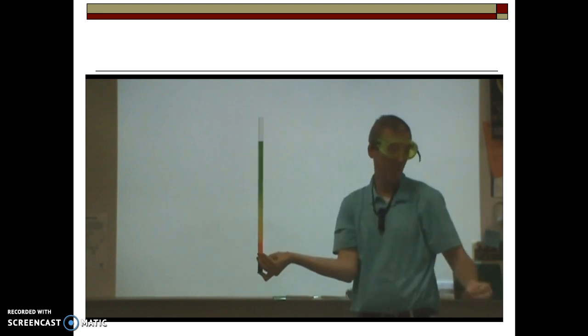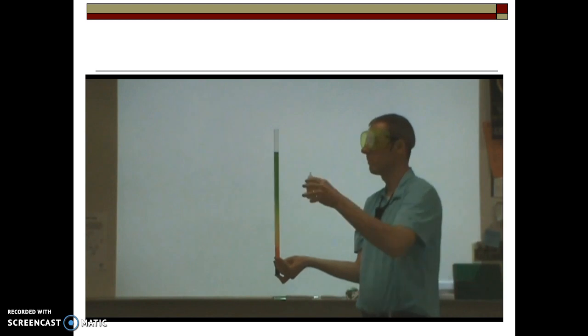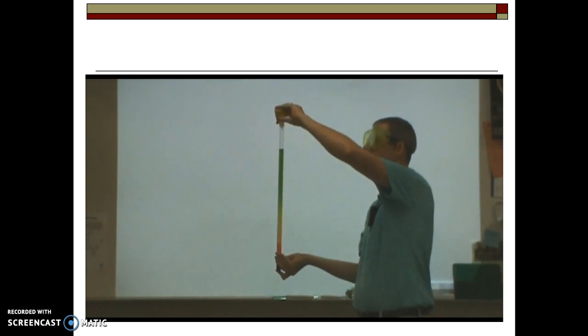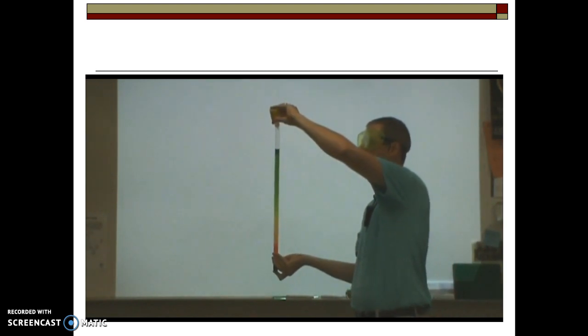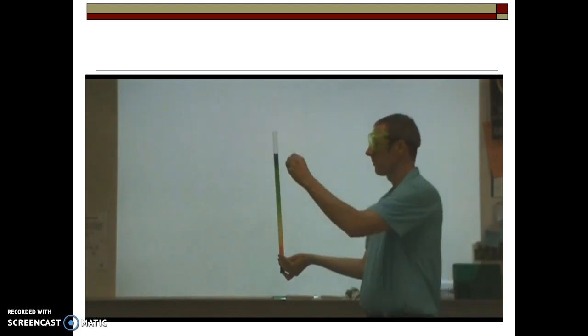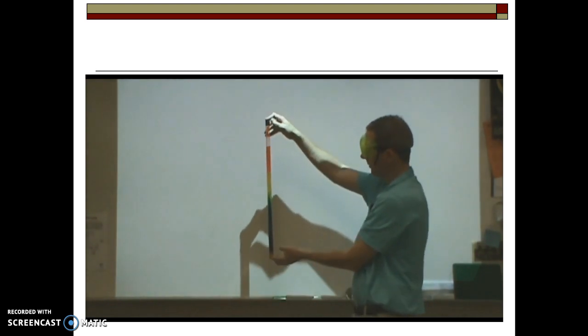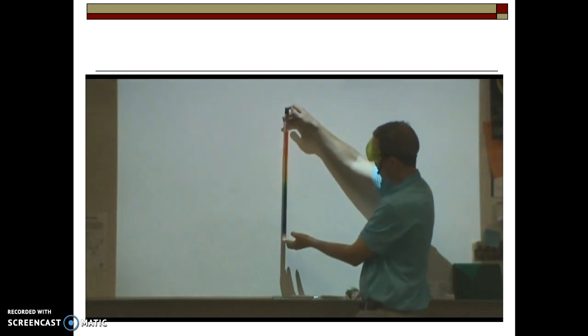And if you look carefully, you can see it's having a little effect. And in case you're wondering, that substance A he dropped in was colorless. Now he's taking another thing he's calling substance B, which is also colorless, and he's putting eight drops of that in the tube.